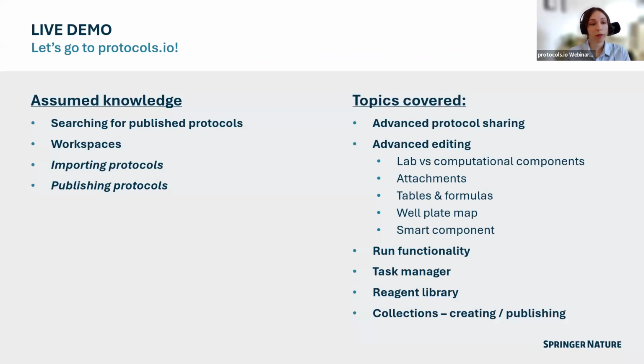All right, so now that we've covered some of that information, I'm going to hop out of the presentation and into protocols.io. Some of the assumed knowledge for this webinar is being able to search for public protocols on the platform and having a general understanding of how workspaces work on protocols.io, as well as importing and publishing protocols.